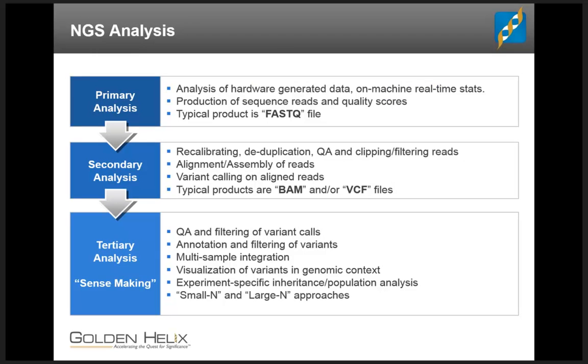I'd like to start at the very beginning here with sequence analysis. This is a slide that many of you have probably seen before, or at least something similar to it, where we talk about the different stages in sequence analysis. And we like to break it down into 3 categories: primary, secondary, and tertiary analysis.